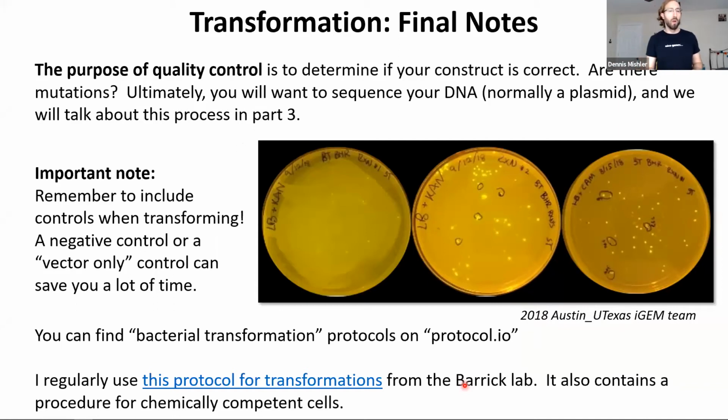Okay, we're going to talk about that process in some depth in part 3 of today's webinar. So come back in 20-30 minutes and we'll be talking about that. But an important note, I really want to highlight this for transformations. Controls for transformations are really important, especially negative control or some sort of vector-only control.